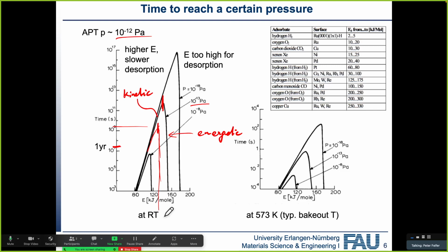You can even notice that if you look at the logs of our instrumentation, if we have a sunny day outside and the sun is shining directly on the chamber and it gets 1 or 2 degrees warmer, you can see that in the vacuum levels, just because the residual desorption will just speed up a little bit.